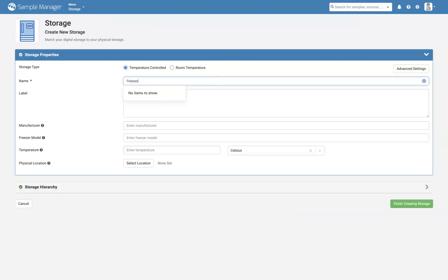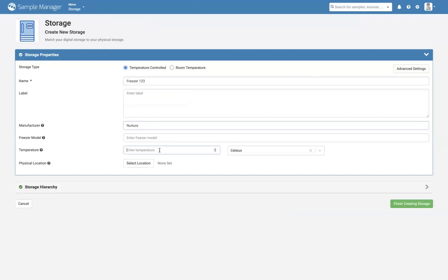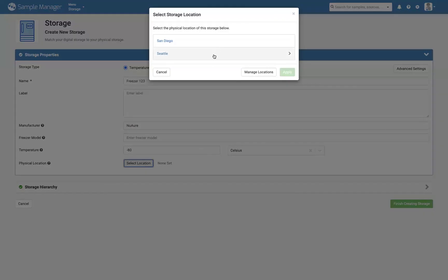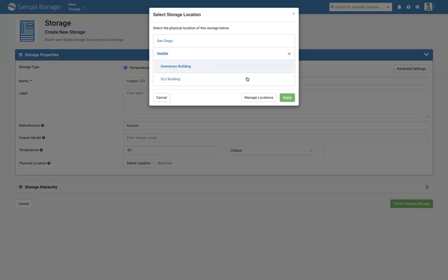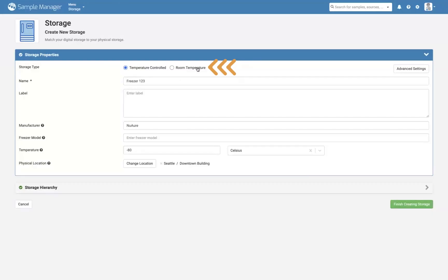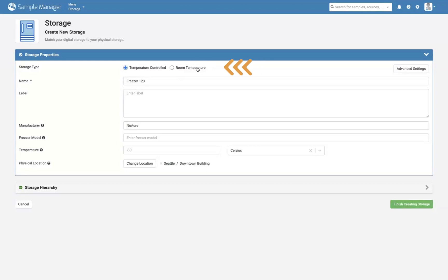Fill out the freezer name, manufacturer, and temperature, and indicate the location if you have one. Note that for room temperature storage of slides or other materials, you can select Room Temperature.